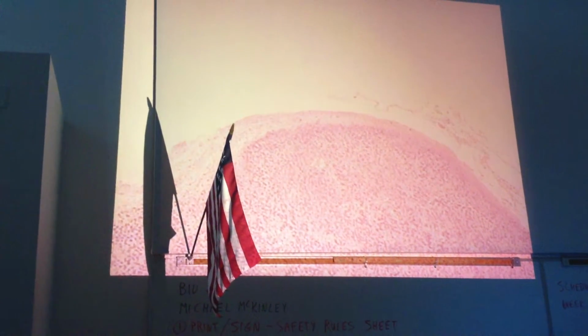And the very last slide we look at is the pineal gland, which is non-functional in us, pretty much at this point in time. It's much more important when we're younger. And the cells degenerate. When they degenerate, they calcify, and that's referred to as brain sand. It will be obvious to everybody when you see brain sand. These are still living cells right here. When we come down like this, and that's brain sand. Degenerated cells that have calcified and then just acquired waste material and are storing it.